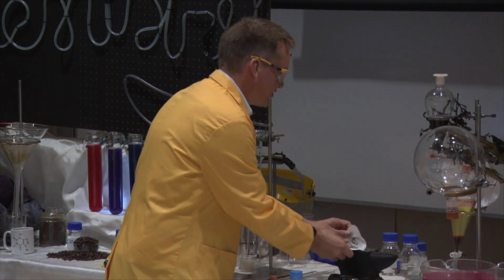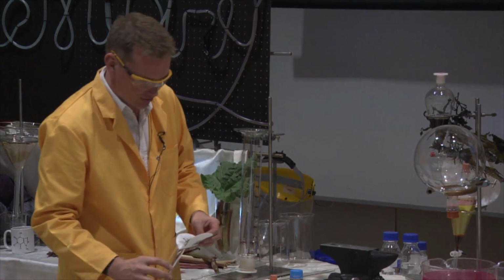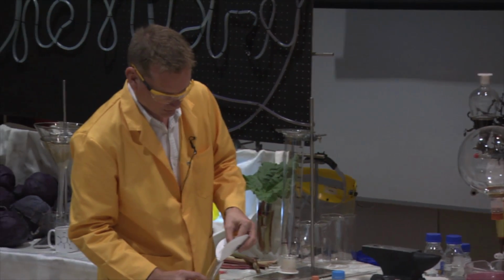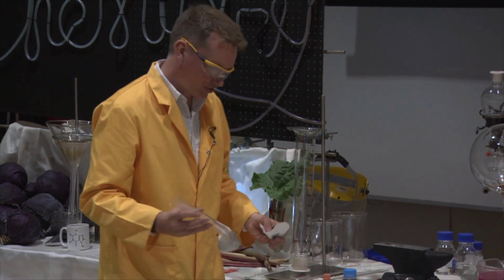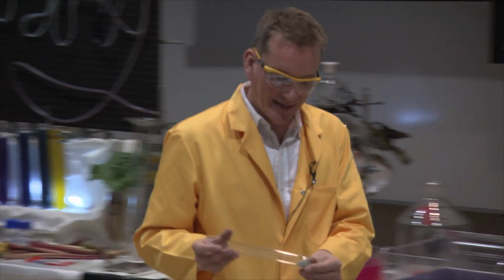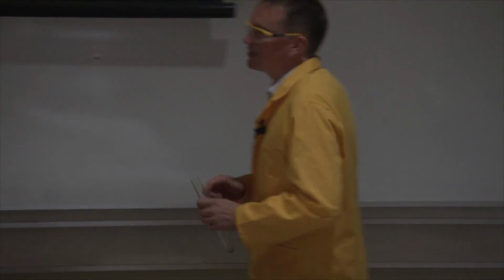So it's quite easy to powder, and I'm just going to tip some of this into this tube here. So here's my fool's gold, my iron pyrites, and now I'm just going to heat this up. Okay? So this is our mineral. This is one of the ways that we could find iron and sulfur combined together.